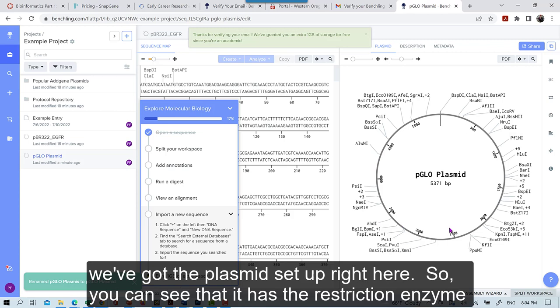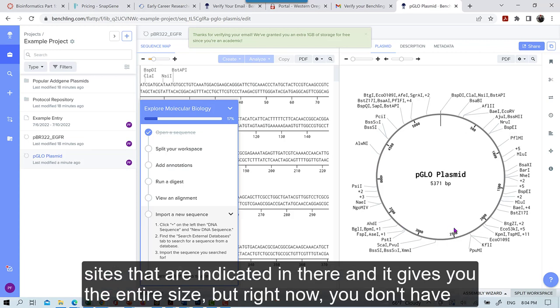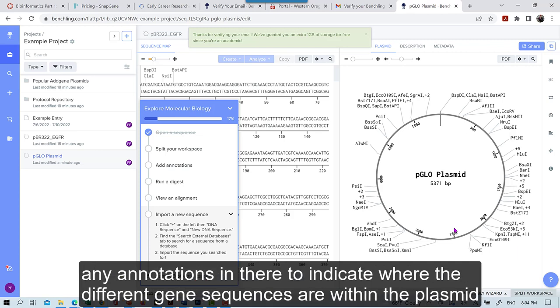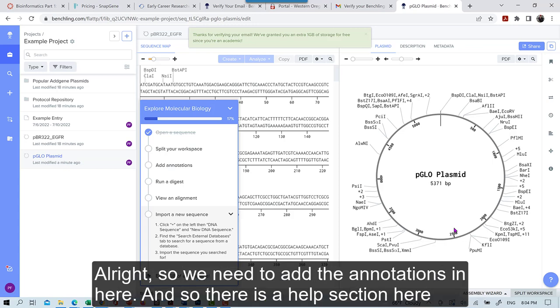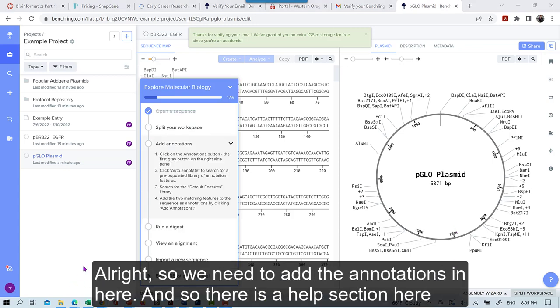So you can see that it has the restriction enzyme sites that are indicated in there. And it gives you the entire size. But right now you don't have any annotations in there to indicate where the different gene sequences are within that plasmid. Alright. So we need to add the annotations in here.